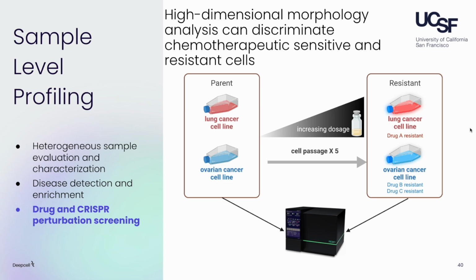In this next dataset, we'll show an exciting study that we did monitoring drug response using morphology as a readout. We treated K562 lymphoblast cells, which are isolated from a leukemia patient, with chemotherapy drugs. We were interested to see how morphology changed over time with treatment, and we're especially interested in morphologies which might be associated with resistance.